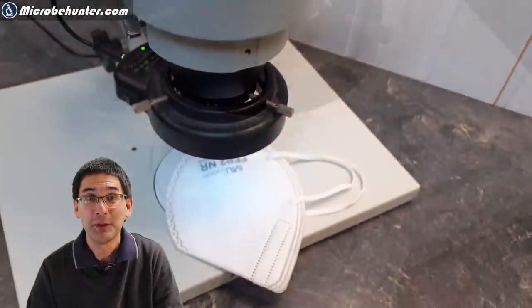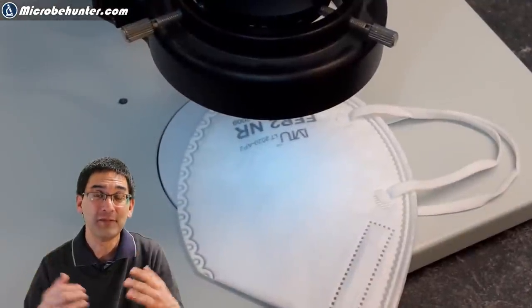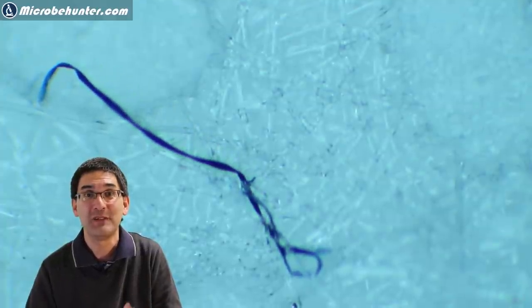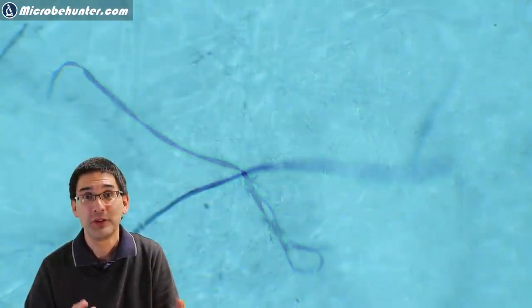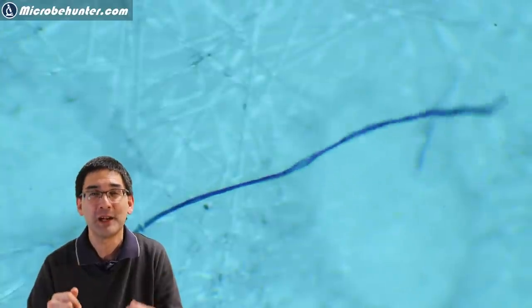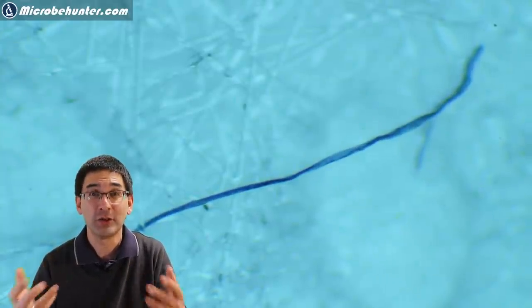I wanted to get a better image quality so I placed the face mask directly under my stereo microscope and here of course I was able to see the fibers as well and here too they were moving in a very interesting manner almost like they are alive.